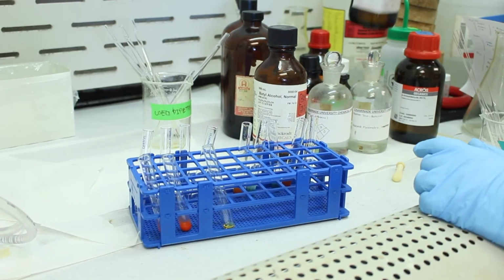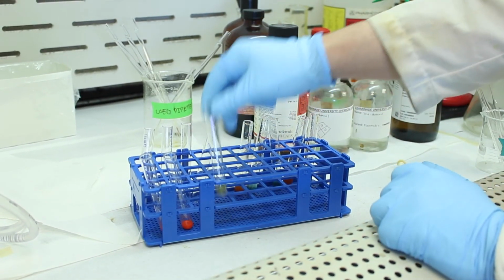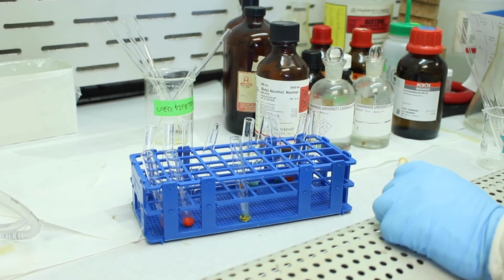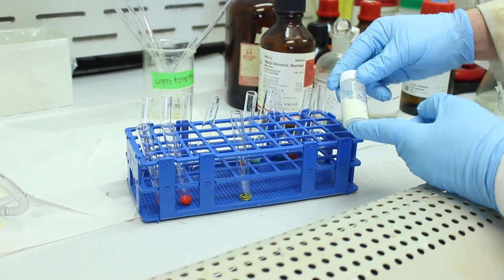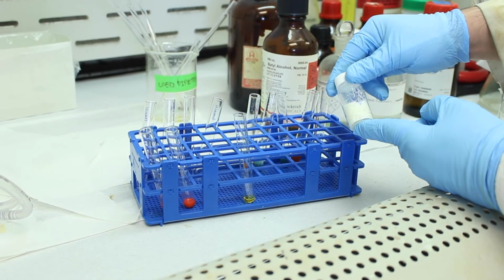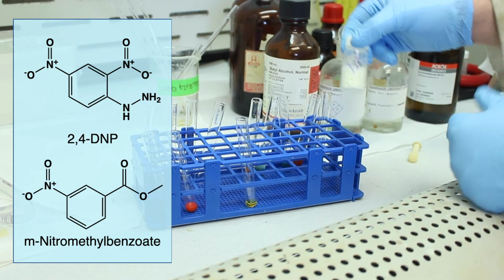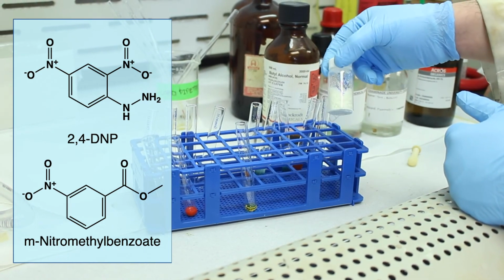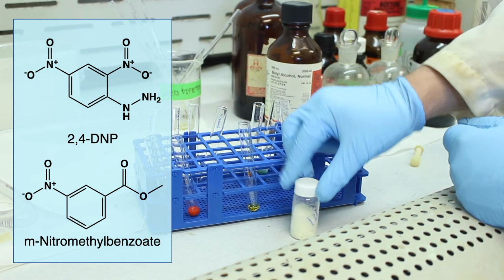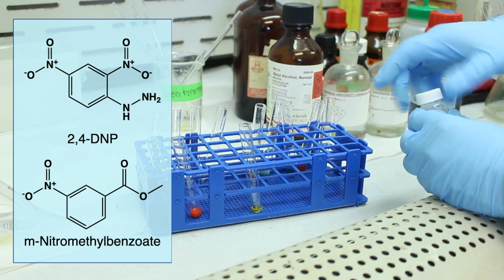The final one we're going to do is a little bit of a negative control where we know there's going to be no reaction. So I've taken the nitration product from the previous lab, methyl m-nitrobenzoate. So this is an ester. There's a nitro group, but we're concerned with the ester. Now ester is a carbonyl functional group, but it does not react with 2,4-DNP. So when we mix the solid with this DNP, we expect there to be no reaction.